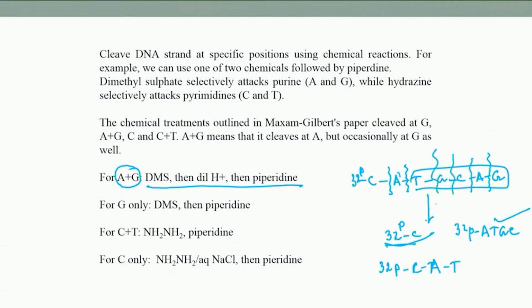Again I repeat, on the right side I am not bothered, because whatever will be released on the right side will not have any radioactive phosphorus. So, you can discount that. It will not show up in the gel.